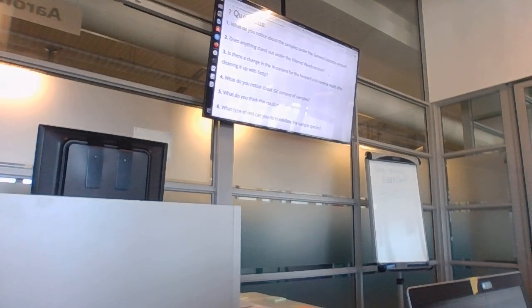So if you didn't create the collections with your data set when you first uploaded, it will obviously look different when you try to run fastp, because you didn't make a selection. So you have to do that part first. Okay. So now you see this says single-end part, but you don't have your collection. So choose the right option and then follow it. Got your file there. Follow this prompt. Yep. Okay. That line, it's fine. Looks good. Use it when you get home. Okay.